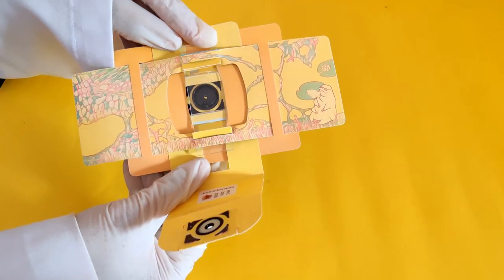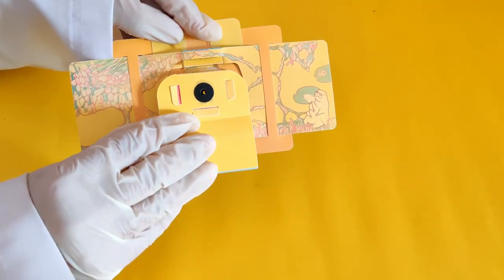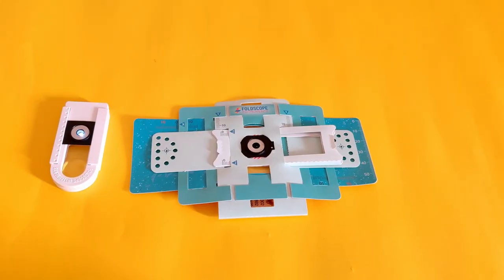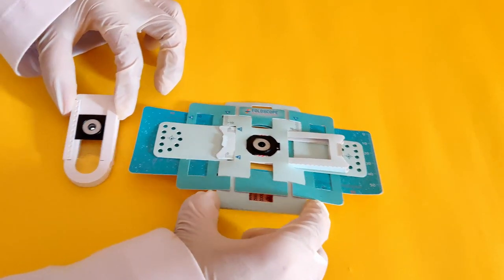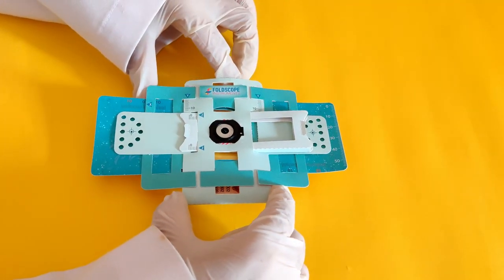Close the flap of the lens stage of the foldscope. Hold the foldscope up to a bright light and view through the lens.